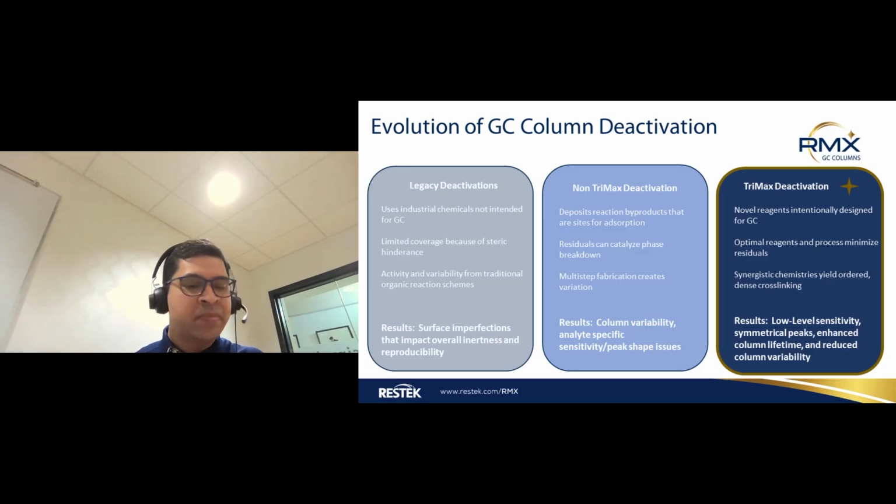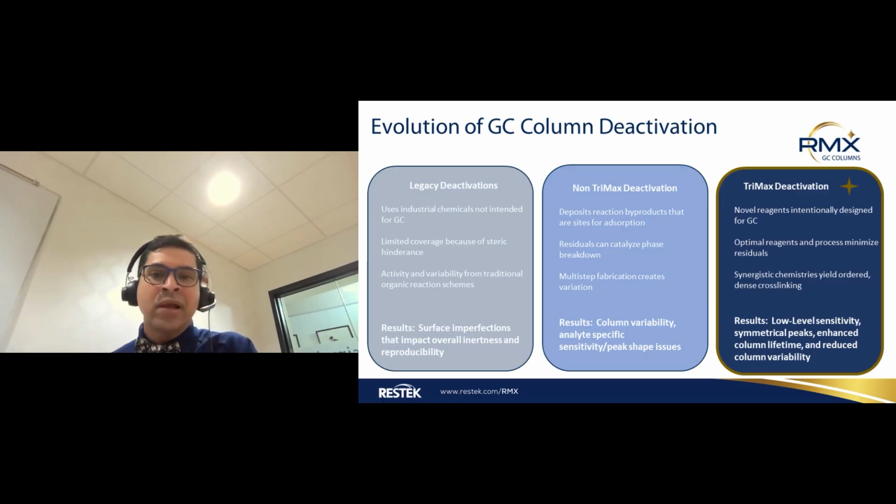So you would see peak tailing, adsorption of the analytes, and that could result in a low throughput method. Now, considering these methods were analyzed 15, 20 years ago, all those methods were looked at in ppm levels, so higher concentration. At that level of concentration, those imperfections did not matter.